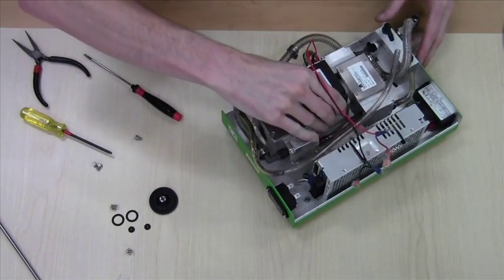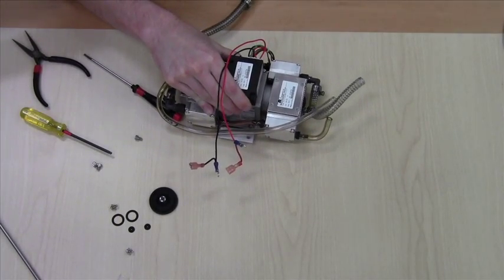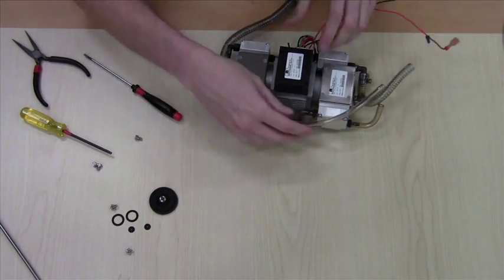The pump can now be removed from the chassis. Now to the diaphragm replacement.